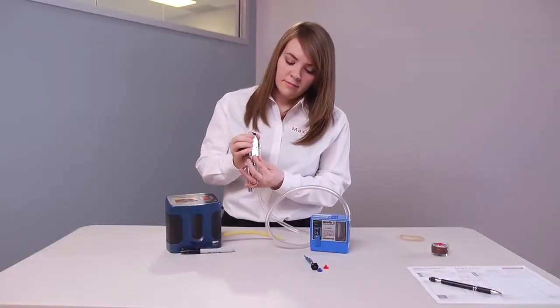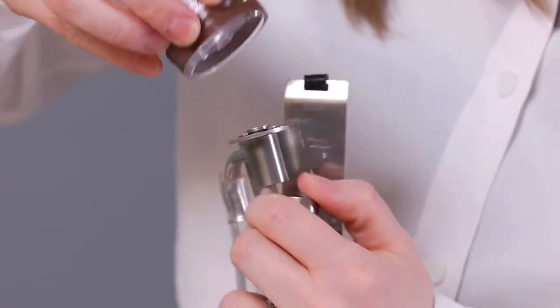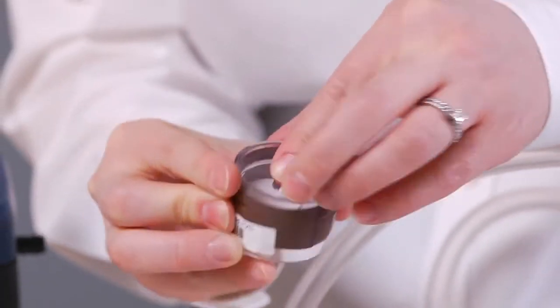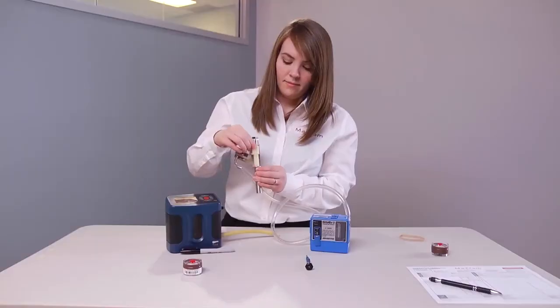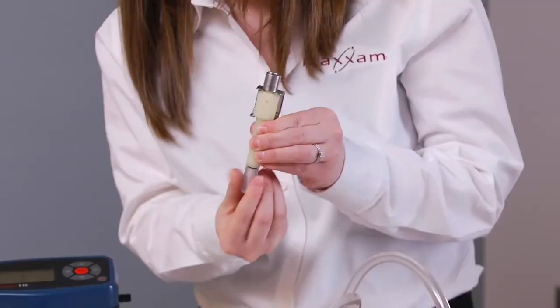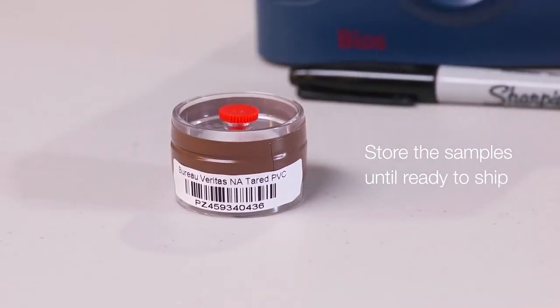Immediately after sampling, loosen the locking nut and remove the filter cassette from the cyclone and replace the two plugs. Discard the contents of the grit pot and store the samples until ready to ship.